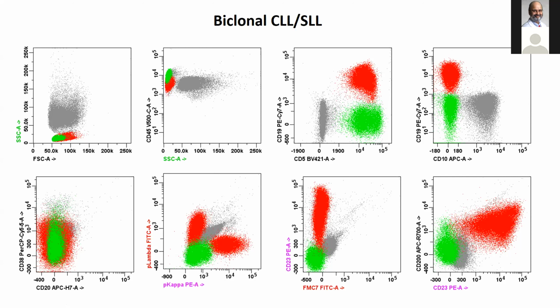And so, looking at the immunophenotype, we couldn't necessarily say exactly what this was, but we raised suspicion that this might actually be two separate clones of a monotypic or monoclonal B cell, or they could be a single clone that has immunoglobulin light chain switch, or they may have started life off and then went off in both directions, lambda or kappa.